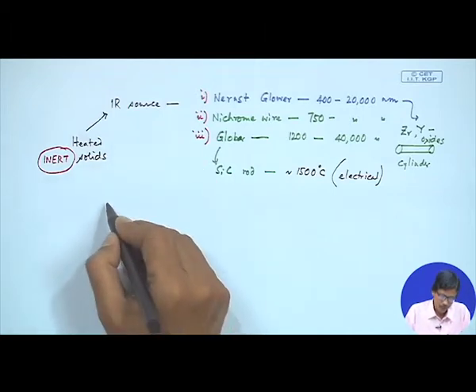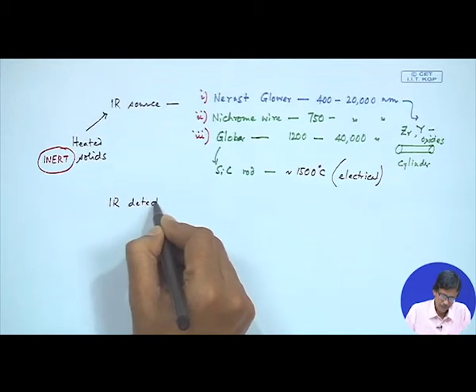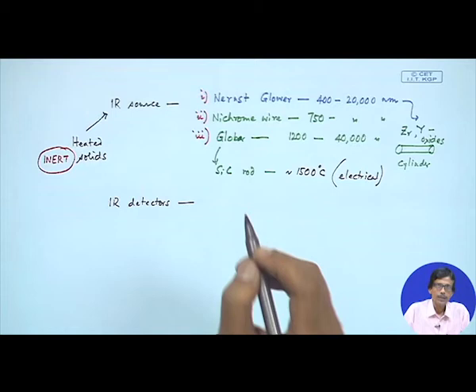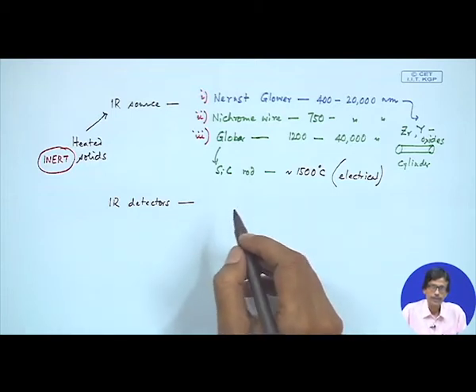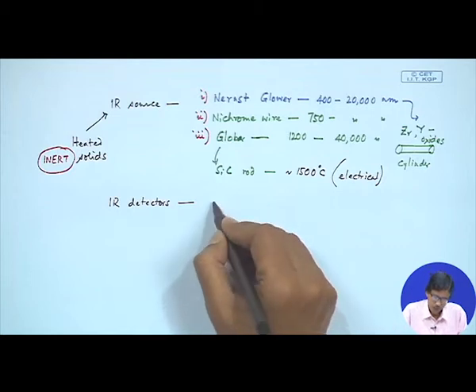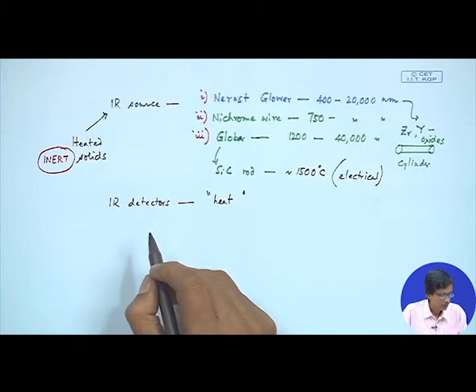Then come the corresponding IR detectors. What we can use are detectors which can respond to thermal energy or heat.